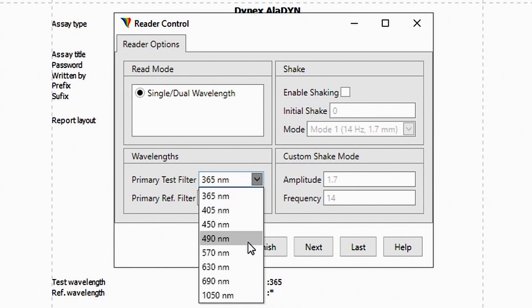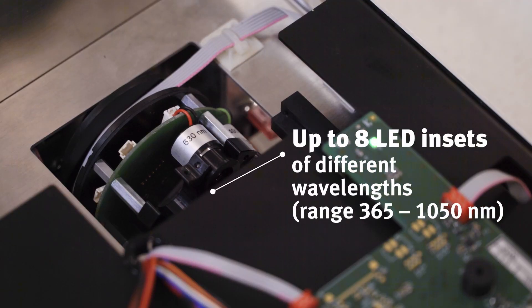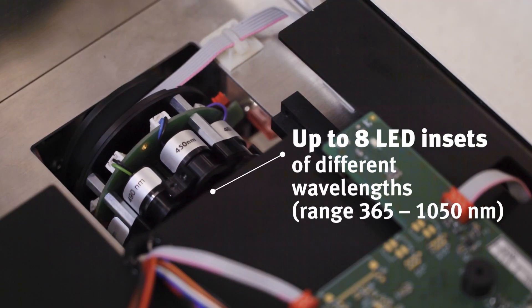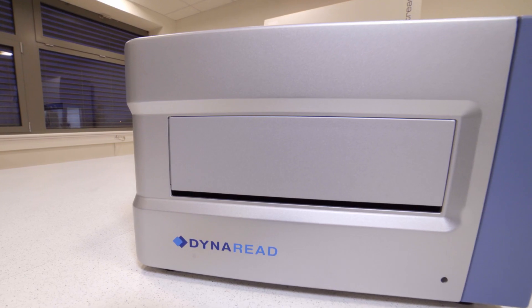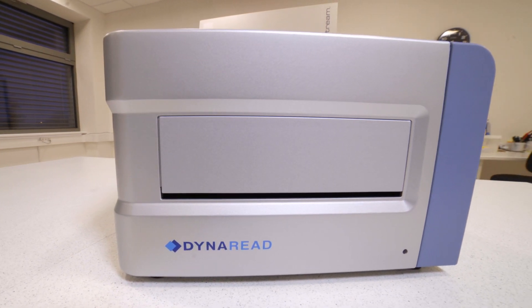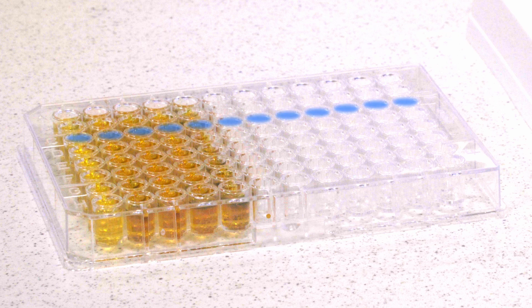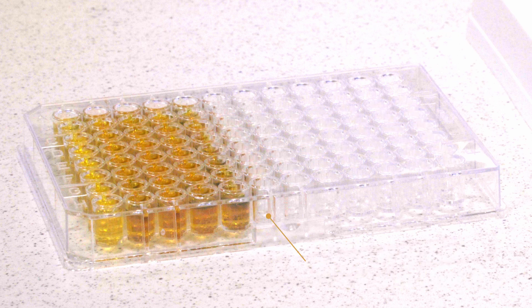Instead of a filter wheel, we've developed an LED wheel that has an extraordinary capacity. Even if you have a broad range of tests requiring different wavelengths to be measured, you can manage it with a single reader. With our deliberate optics that read 12 wells at once, you can achieve great speed and be even more productive than ever before.